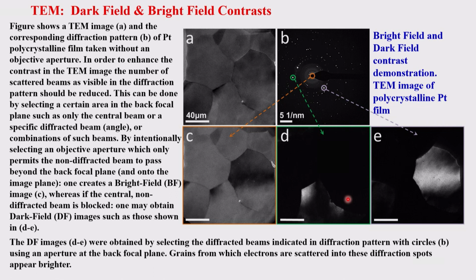So these are all you can see. This is called the bright field part of it, and this is the dark field. So exactly reverse of that. This is done by adjusting the scatter, diffraction. Here the details are given, which is not important.